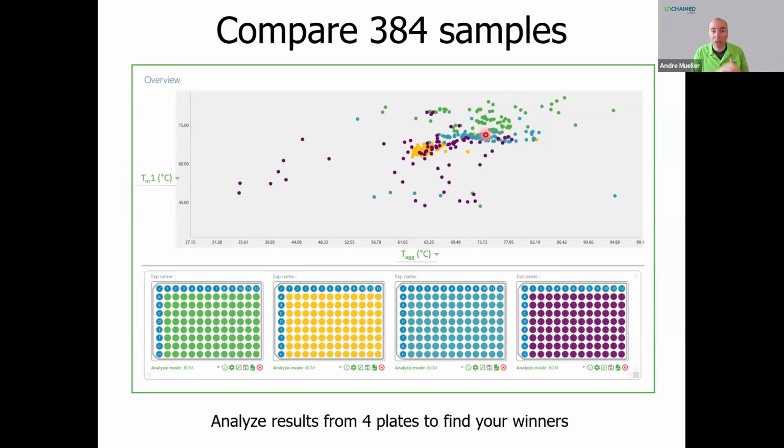the individual spectra of these samples and how they compare to one another. So built into the software is already a very straightforward way of analyzing several experiments and drawing the right conclusions easily and smoothly.